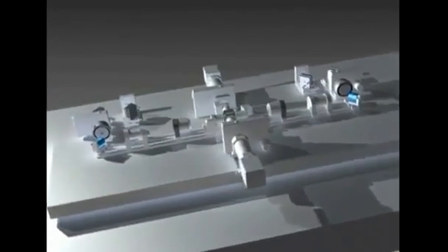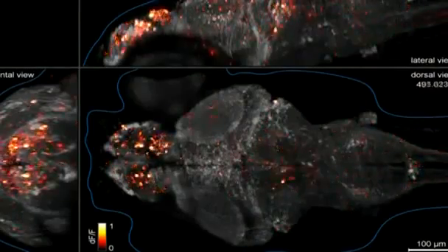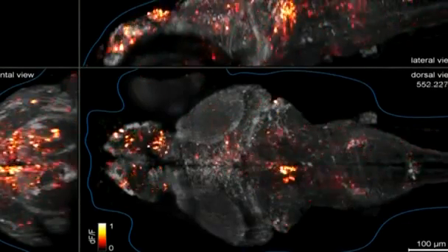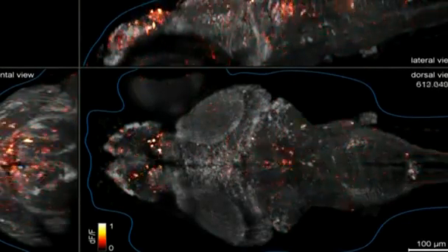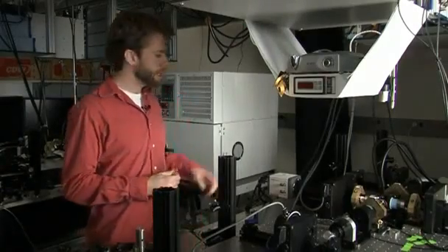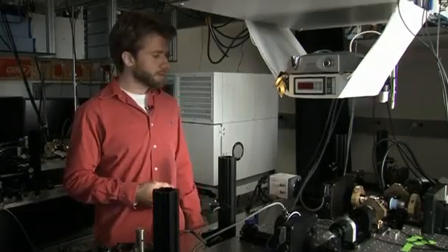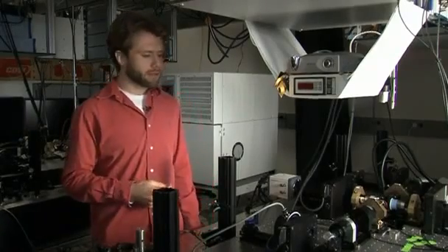The special feature, the special concept in this system is that we can image very quickly a complex, large sample, large three-dimensional volume, and we can actually look at that volume from multiple different perspectives at the same time. Those multiple perspectives, or sheets, are combined by a computer program to form a single moving three-dimensional image. Because everything but the sheet is essentially invisible, we can capture what happens in the sheet that's being excited very accurately. And through molecules that report neural activity, we can then essentially see what these neurons are doing at the time that we're filming them.